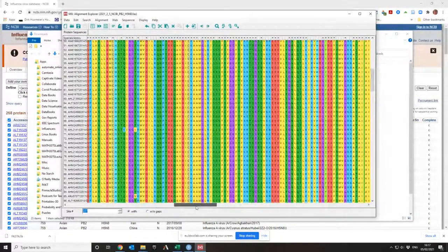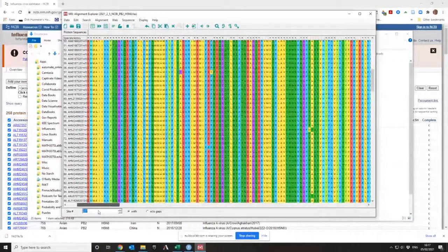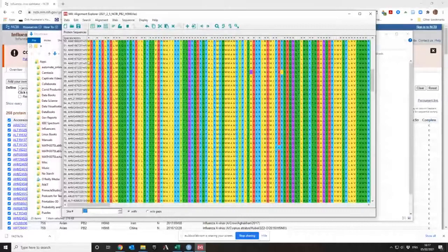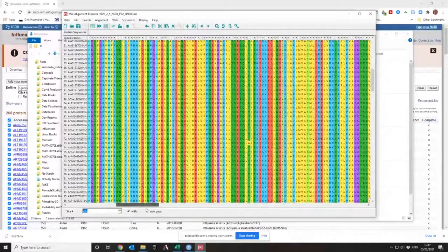Now to clean up your sequences to start with, you want to look along that top line, because the stars represent things which are the same in every single row of that particular column. In DNA space, there's a bit more variability than in protein space.